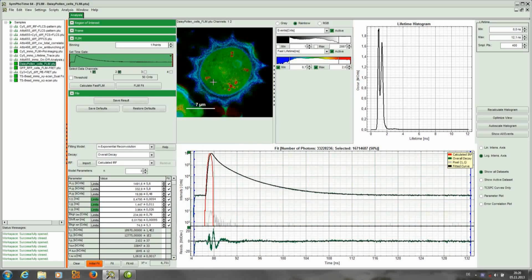For a set of observations {d(t_i)} of the fluorescence signal in time bin i, the lifetime estimation is carried out by minimization of chi squared equals the sum over i of [d(t_i) minus d_0(t_i, a, tau)] squared.